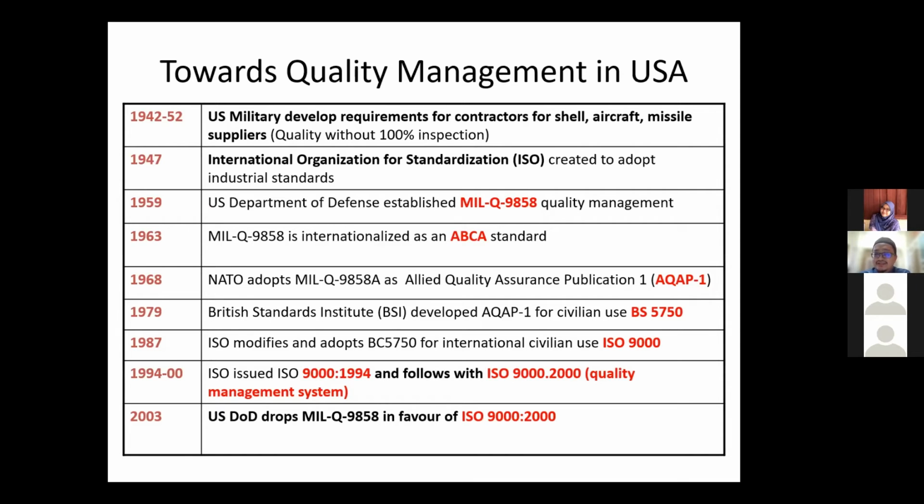That is their aim. Sama lah kita pun harap-harapnya kita nak capai satu keadaan yang ideal where we have all these policies, we assume that everyone will follow. Even kalau kita tak buat audit pun, actually the accuracy, the efficiency would reach 100%. Okay. So from the US military ni, dia berjangkit kepada other types of industries. Everyone wants their machine to be tip-top, and then they form the International Organization for Standardization, ISO. Okay, then adalah Department of Defense, etc.